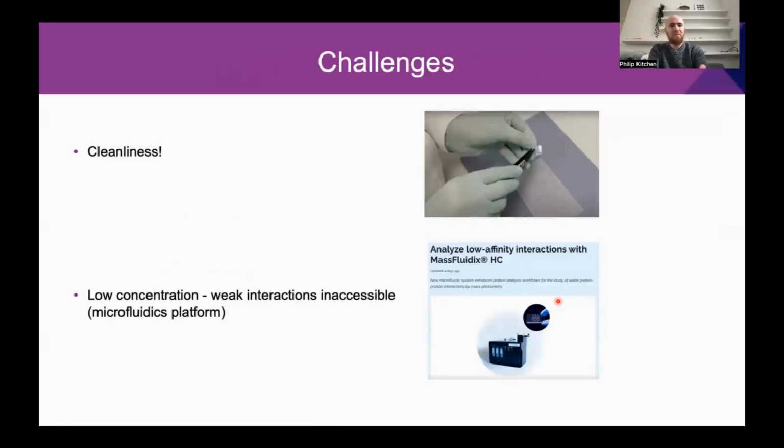Okay, I thought I'd also describe a little bit about the challenges that we faced. One major thing is cleanliness. It's a single molecule technique and very sensitive to any kind of small dust particles and so on. So it took us a little while to get used to working at the level of cleanliness required to collect good data. That's something to keep in mind.